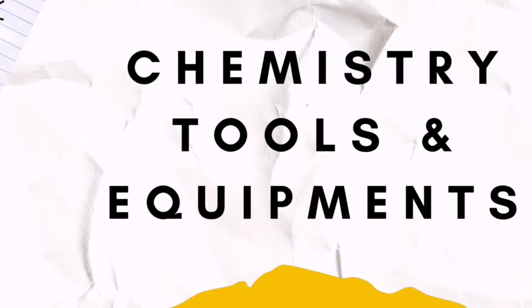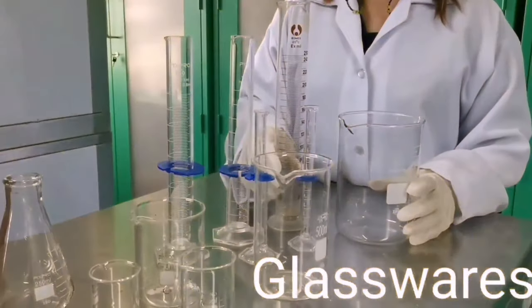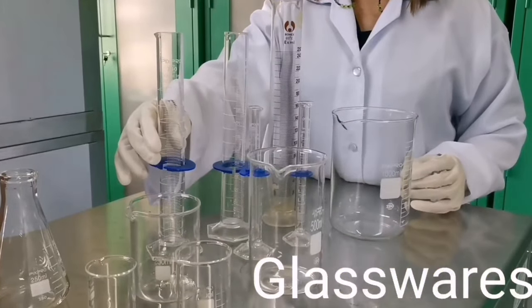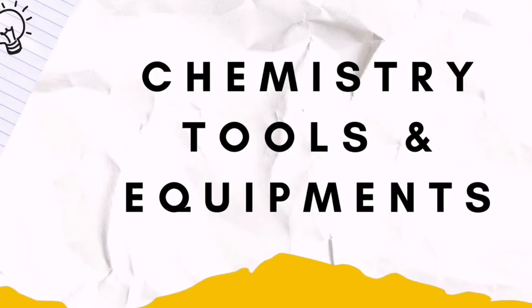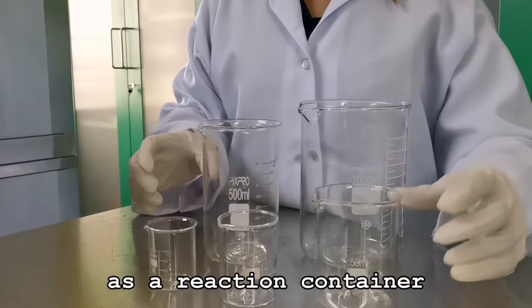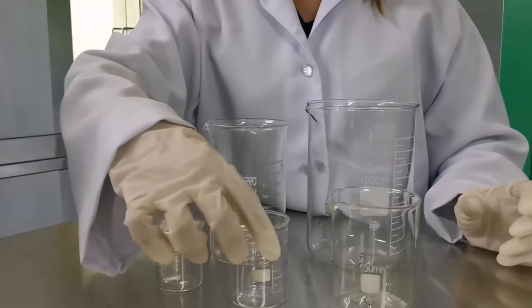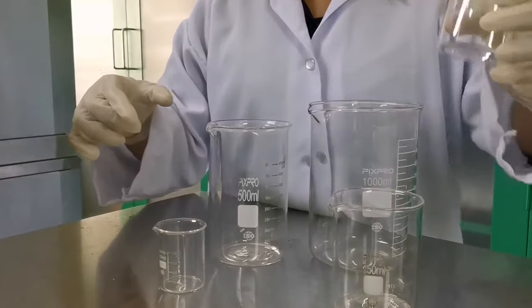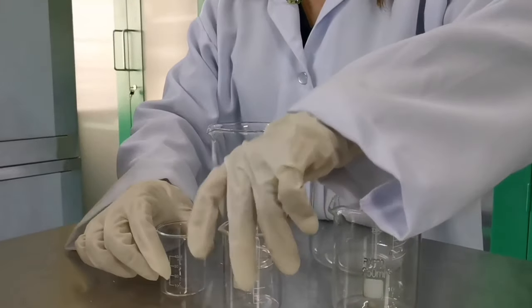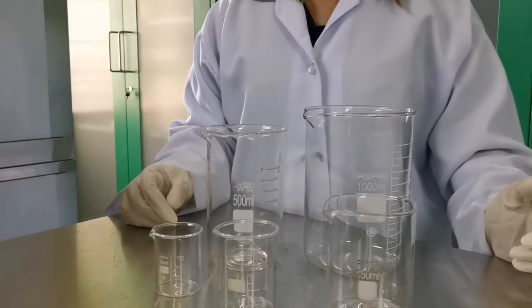Chemistry tools and equipment. We're gonna start with some basic glasswares. These are beakers, flasks, and cylinders. Beakers. Beakers are useful as a reaction container or to hold liquid or solid samples. They are also used to catch liquids from titrations and filtrates from filtering operations. They come in various sizes.